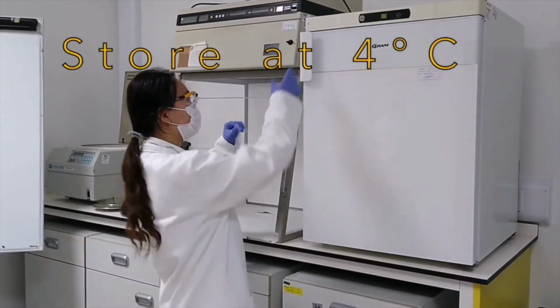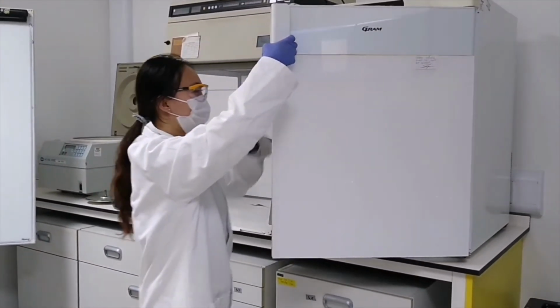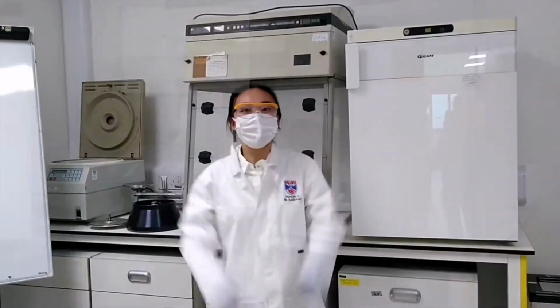Put the soil in a fridge at 4 degrees Celsius, just like your fridge at home. This stops the soil from losing water and preserves the bacteria in our sample.